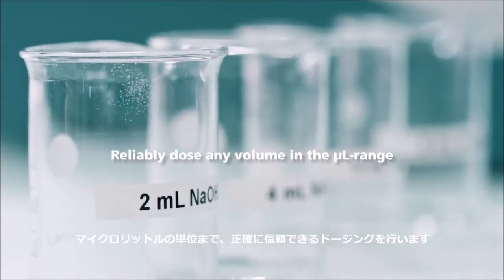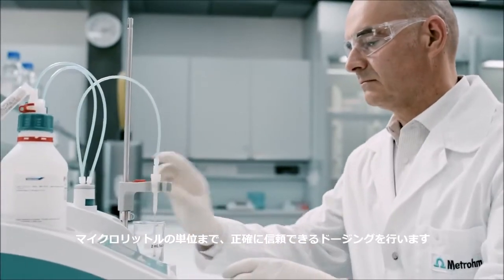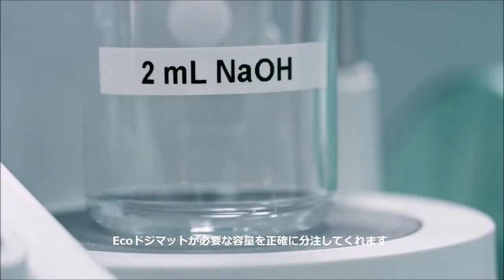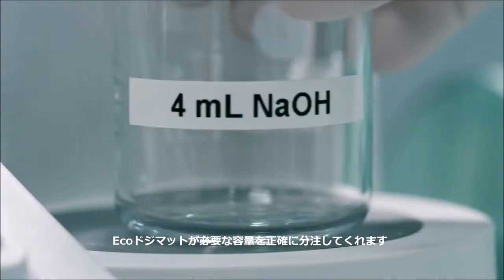Reliably dose any volume in the microliter range. Simply define the required volume, press start, and the Dosomat will dose exactly the volume you need.